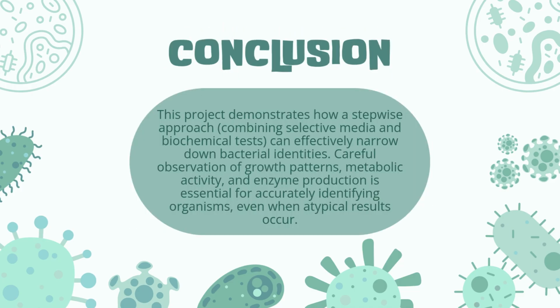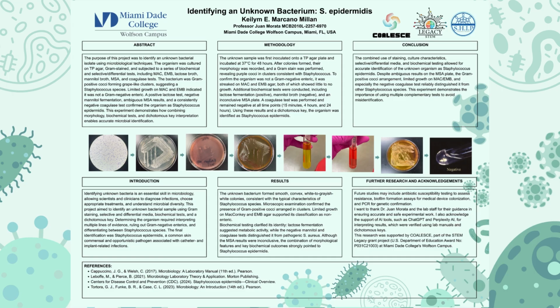In conclusion, this project demonstrated how microbiological identification is both an art and a science. Even when individual results seem surprising or ambiguous, each test contributes a piece of a larger picture. My final poster compiles the full identification process, including microscopic images, media results, and biochemical test interpretation. It serves as a visual summary of how each test contributed to identifying the organism with confidence and scientific accuracy.